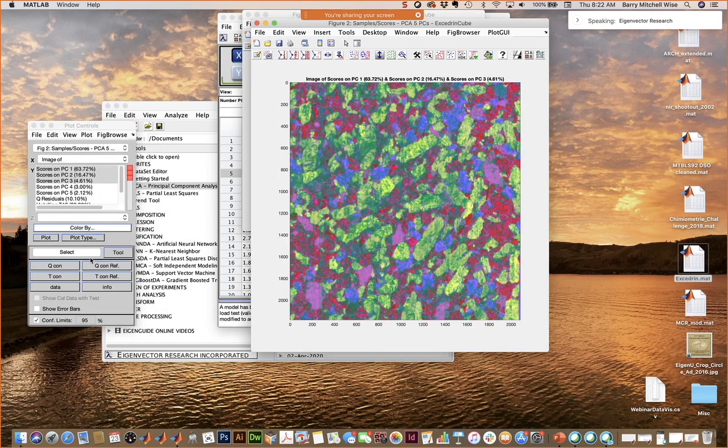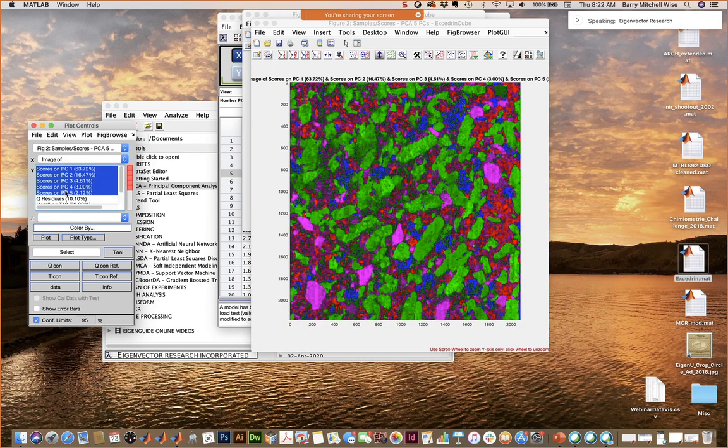If I turn on auto contrast, that essentially spreads out the differences in the middle of the scale a little better. You can actually do all five at once, and it interpolates the colors for the others. So Image PCA is a great way to visualize things, and by coloring them this way, you can really see the differences come out.